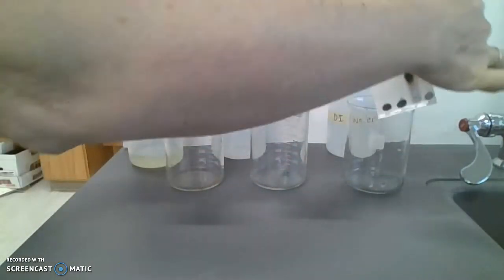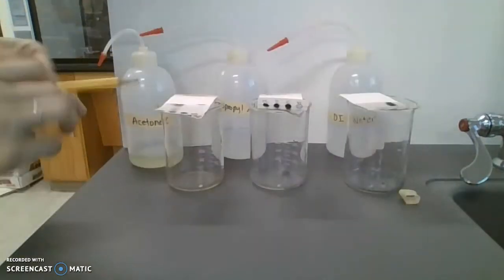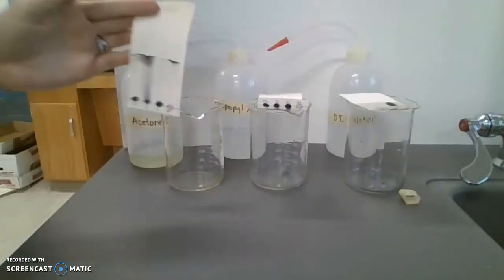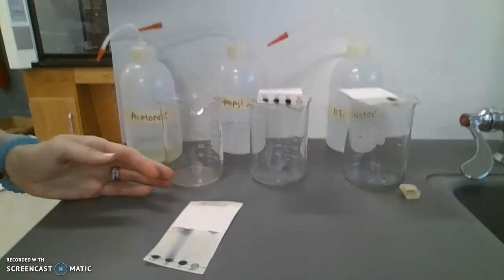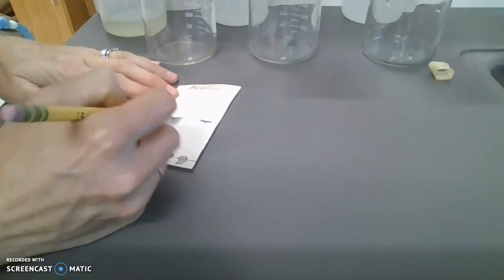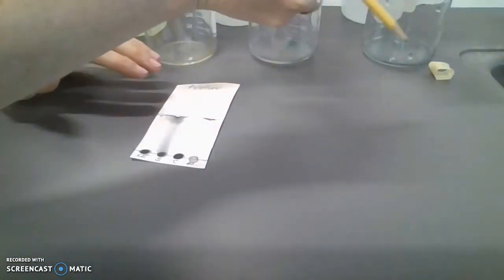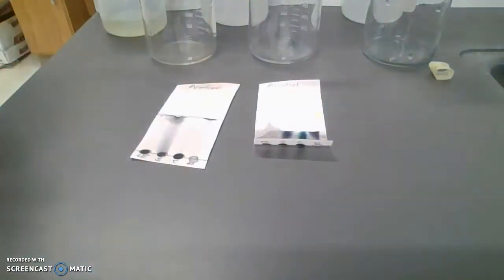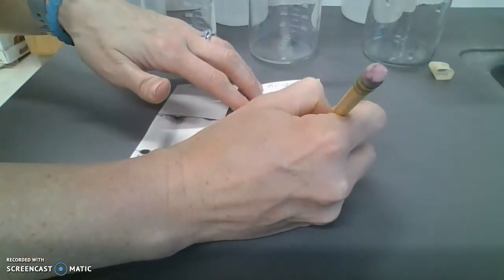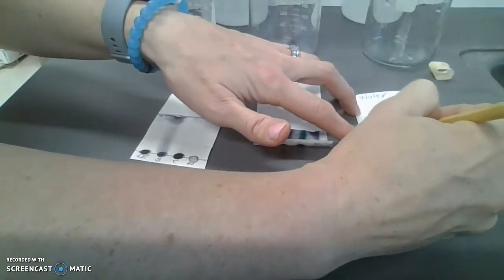And before they dry and it completely evaporates, we need to mark where the solvent front went. So if you lay it flat down on the table, you likely want to go with your pencil and make a line where your solvent made it up to. Because it won't always be visible after it dries.